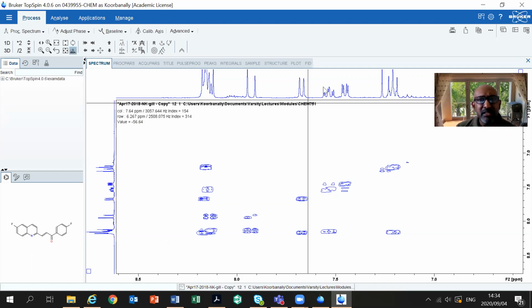And I look at my NMR spectrum and I see I've got a double doublet here, but I've also got a double doublet here that's split by something else as well. And if I look at this particular position of this proton, I've also got a meta proton on here as well. And this meta proton here that I'm seeing is the one we just discussed just now, right?